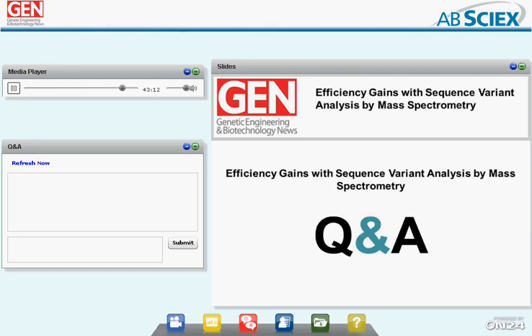And the general intelligence going into informatics is the other one. So being able to, instead of treating databases as a monolithic whole, to actually understand what's going on as part of your detection system, and being able to find taglets, for example, was quite a leap forward, I think, in many of those cases where you know where to go and expend your effort to go and look for things. So a combination of things came together, I think, in the last few years as people have started to think about the applicability to the biotherapeutics market.